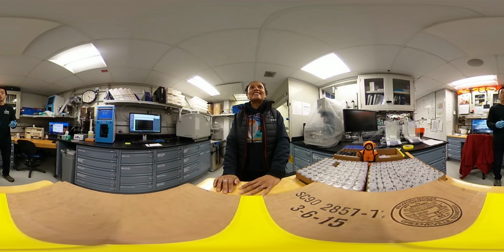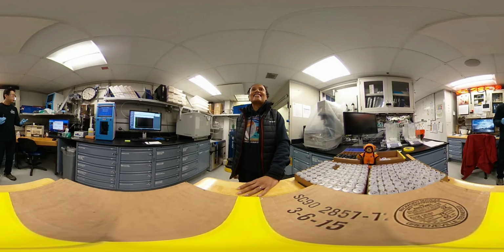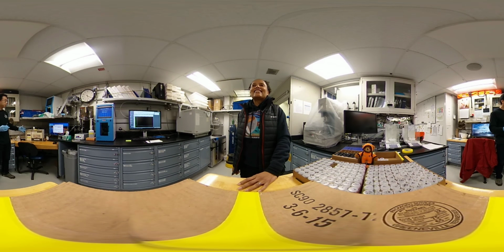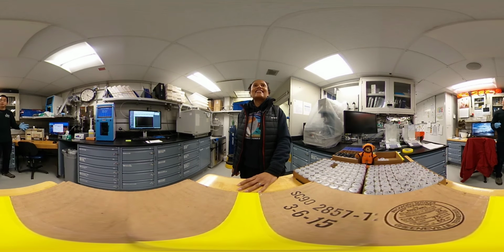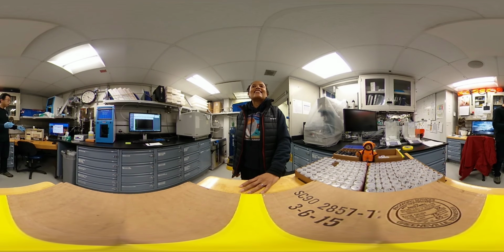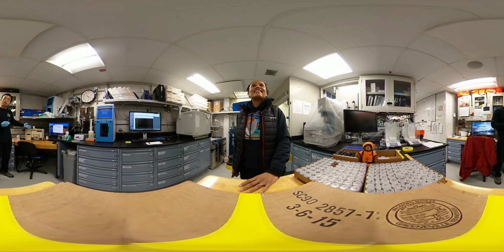Of course, welcome on board. Everyone, welcome to the organic geochemistry part of the Geochemistry Lab. Everything in this next section of the lab starts from here. As we know, we're at sea, so the sea's condition is really rough, the ship rolling a lot. In order to get accurate weighing of our samples, we use this balance here.